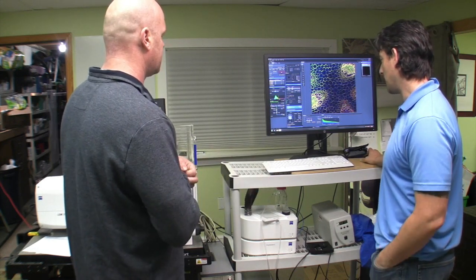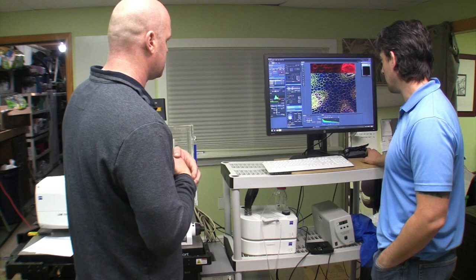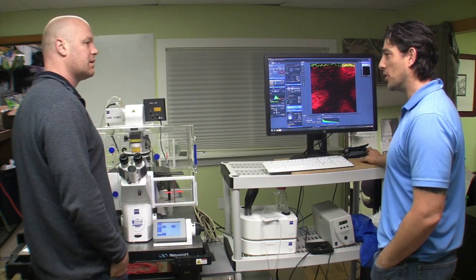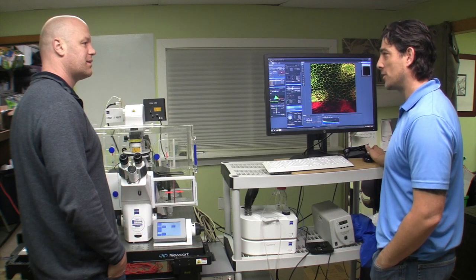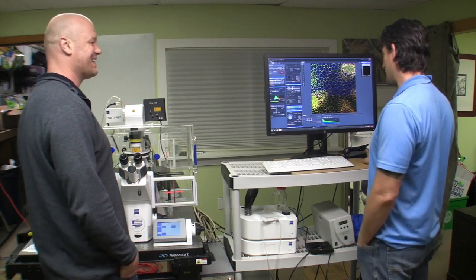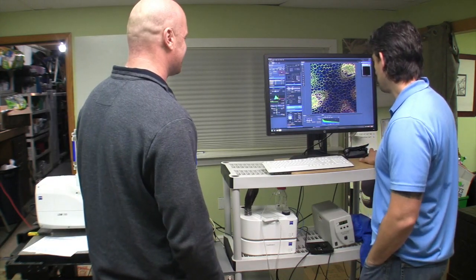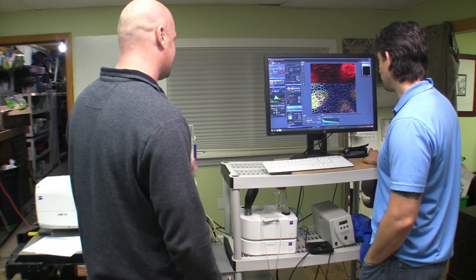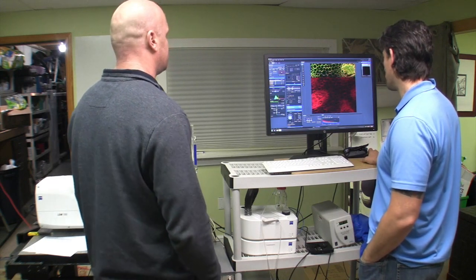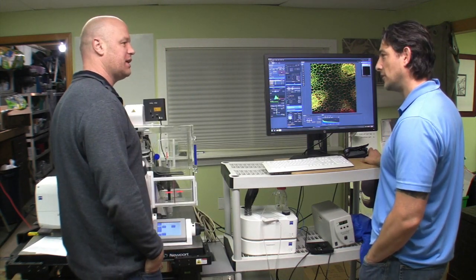It's pretty cool. I don't see a lot of it in the job, but I talk to people who have worms in there and they watch the worm go through the whole life cycle, born and die in this little tube. Or like cell splitting and stuff like that. It's really interesting. So they're looking for pathology.